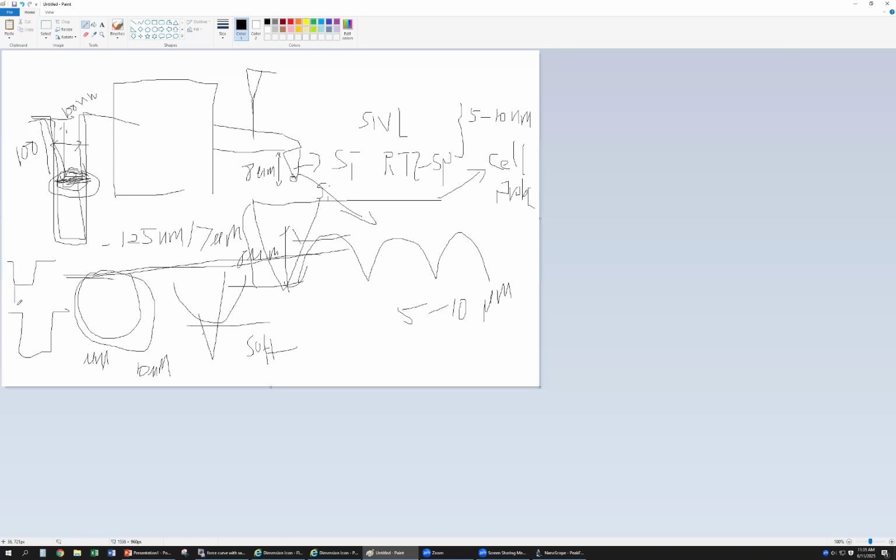If here is open, there is no material. If it is a very soft material and you use a higher force, the probe penetrates and goes inside. If you use a very small force, you may get this one. It depends how much force you use.